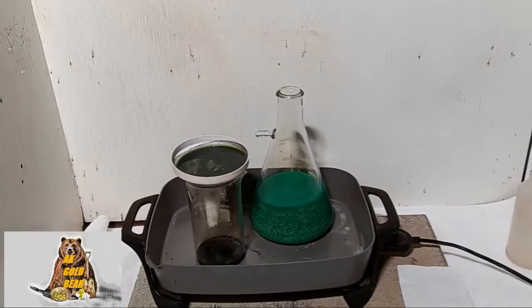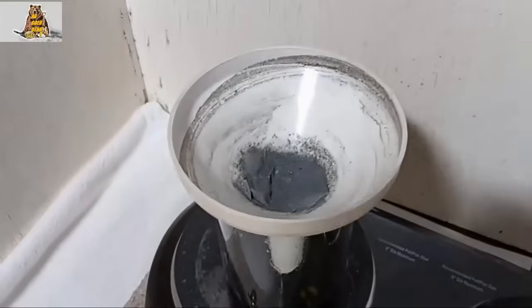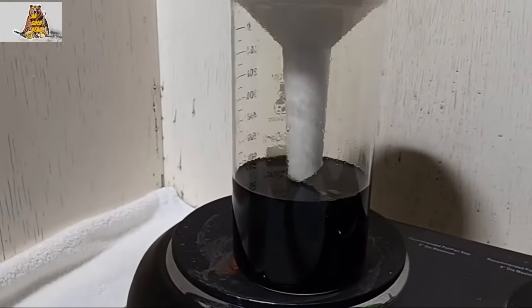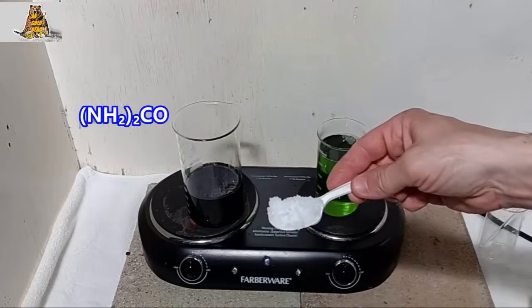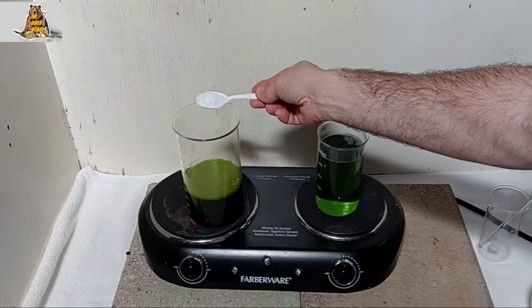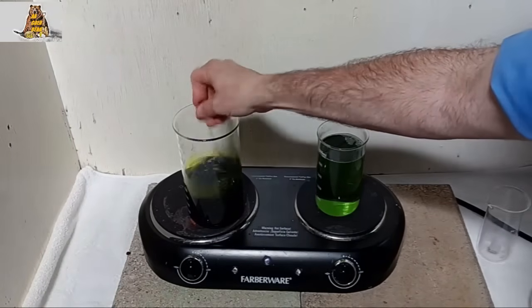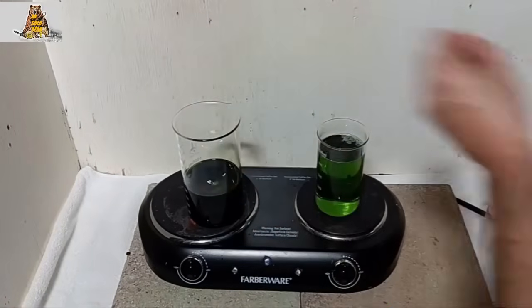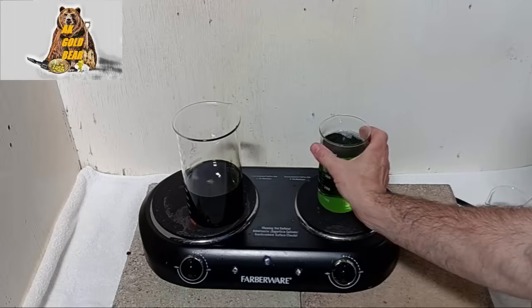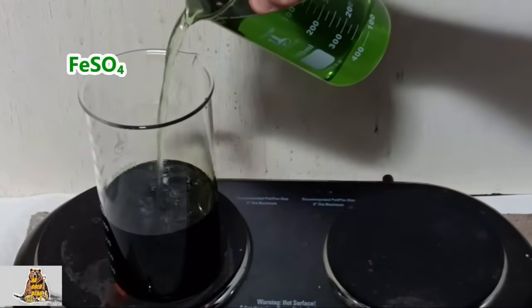I'm going to sleep — it's too late, 1:30 am already. I just came home from work. Filtration is over, a lot of dirt on the filter. Now I need to neutralize the nitric acid. A lot of nitric. And I will precipitate the gold — very nice — with iron sulfate. Very good. Now I need to heat it a little bit.